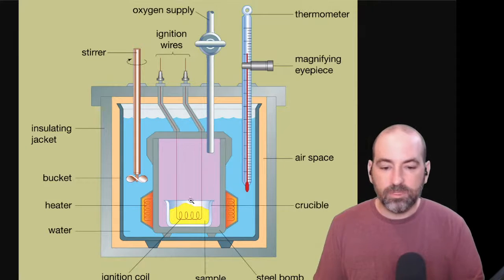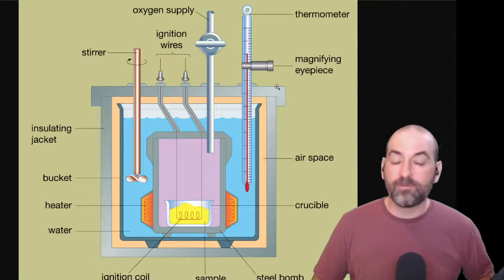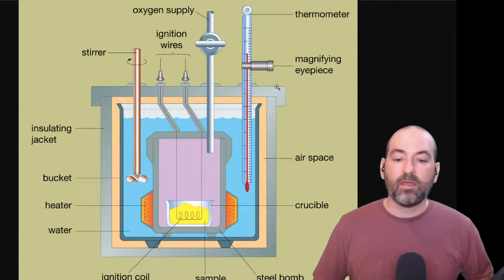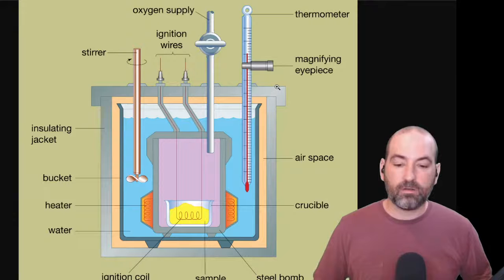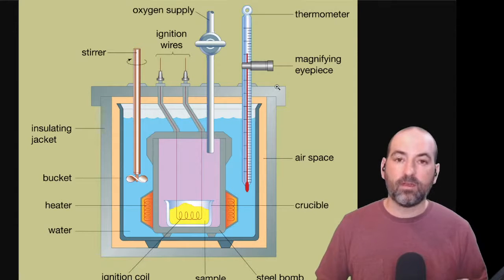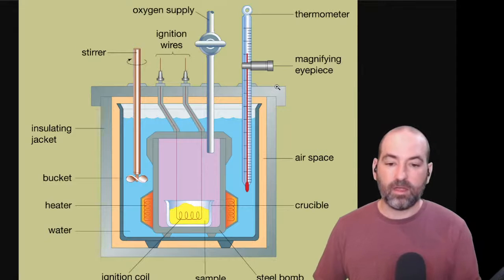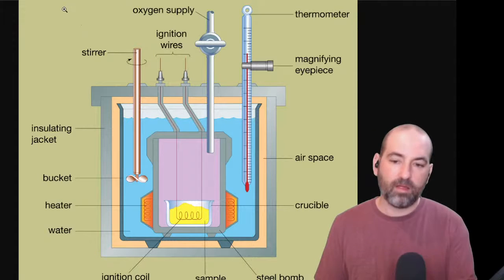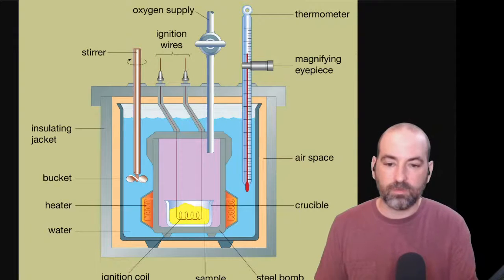So then we'll do it a few times, depending on time in lab, to do a couple of these measurements. Then when we have the data, we'll have some measure of reliability, because we'll have some reproducibility, hopefully.